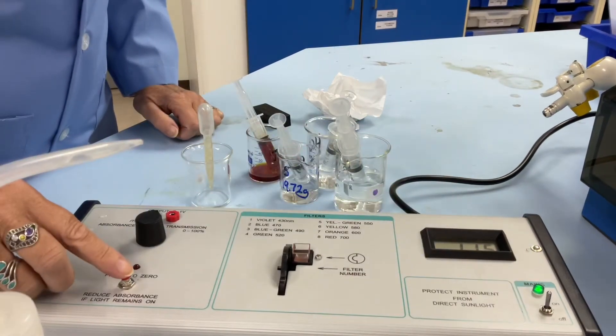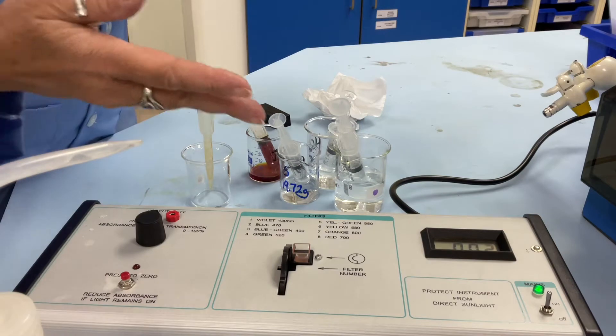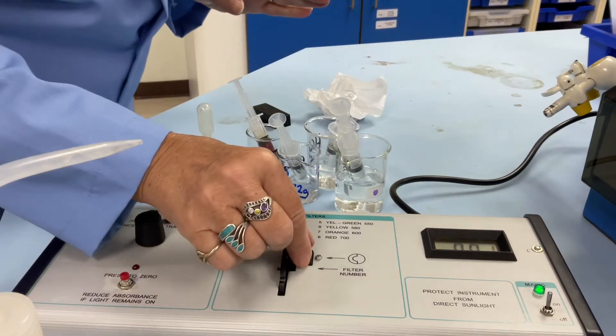All I have to do now is zero it — that's called a blank. So we've just got the cuvette and the distilled water as a zero.